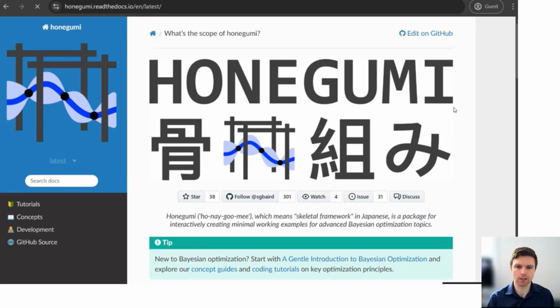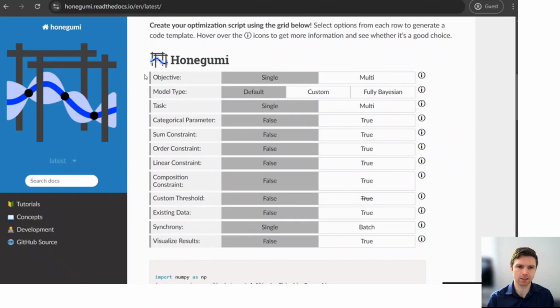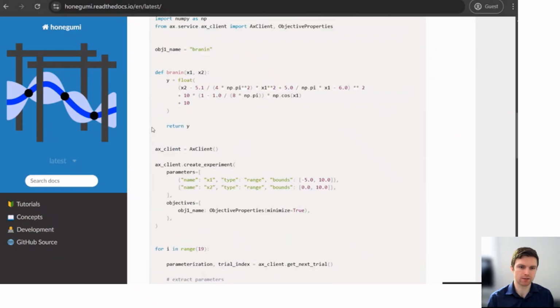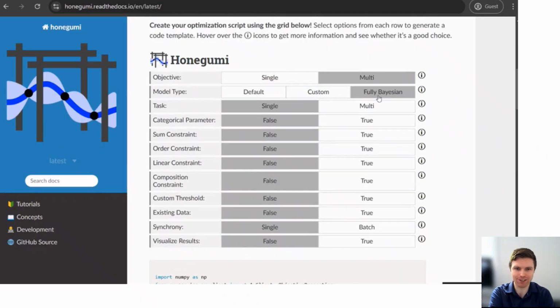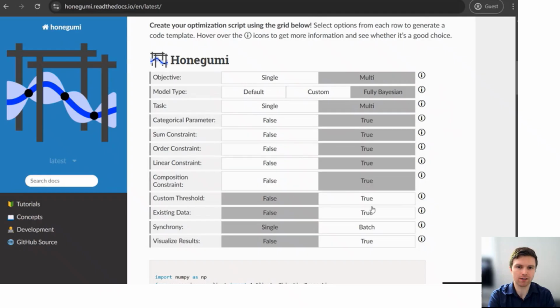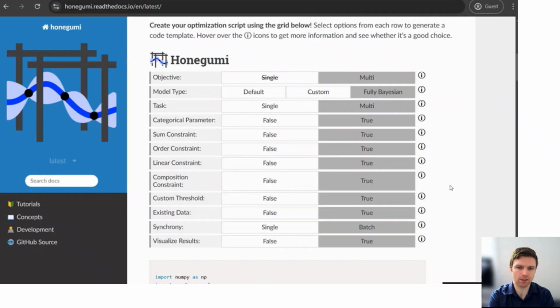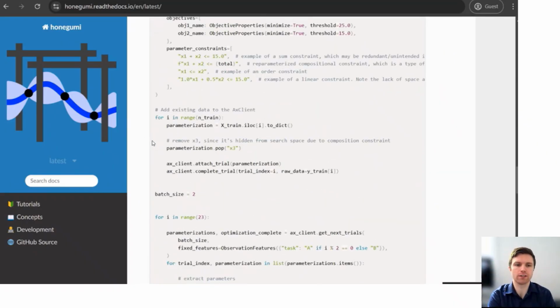You can see that tool in operation here, where we can toggle these different aspects for a number of different types. And if we get a little obnoxious and just turn everything to the more advanced state here, this template will dynamically and automatically populate that full working example.